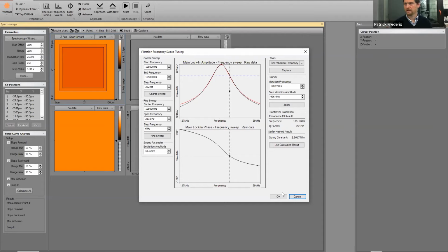FlexANA originated from an automatic measurement protocol. You have a motorized stage with an overview camera where you can look at an area of several square centimeters, select positions on this area, and then move automatically from one area to the next, recording many maps of mechanical data. So you can start it in the evening, and next morning you can come back and check the measured data.